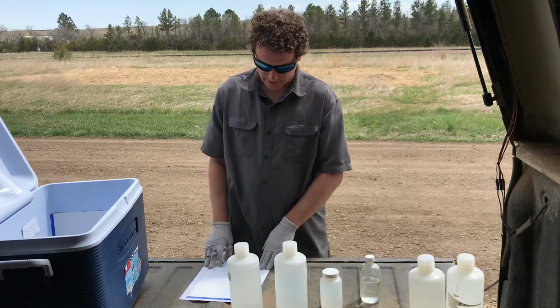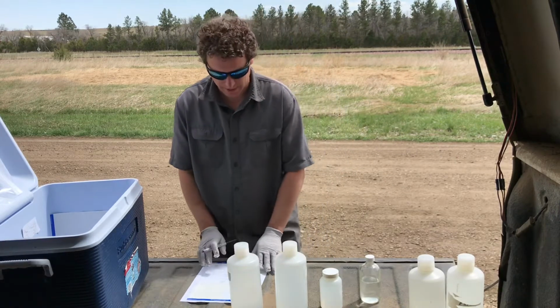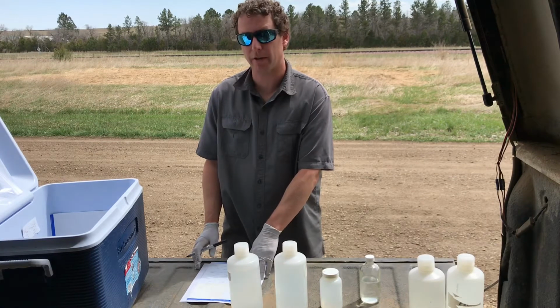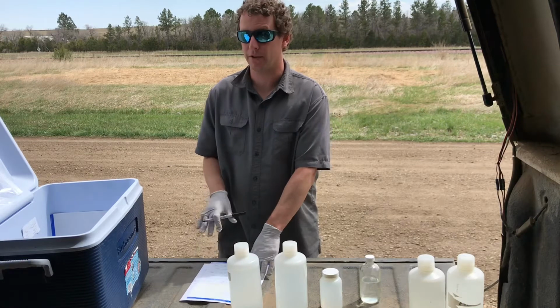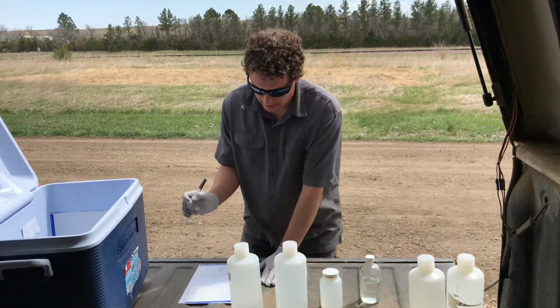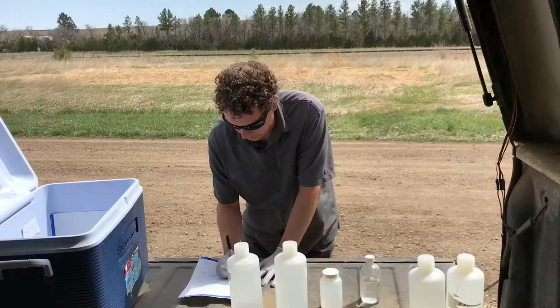So step 1 is to fill out our labels, and the most important thing when labeling your bottles is to make sure that you have the right label. And we match up the station on the label with the station on our data sheet, and that's the station that you should have collected that sample at. All 3 of those should be the same. Filling out the label is really easy. The date, time, and our initials are all that's required for a routine sample. So I'm going to fill these out real fast.